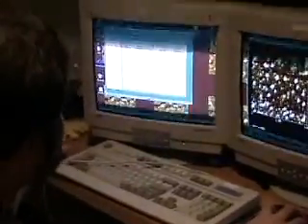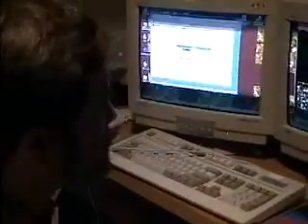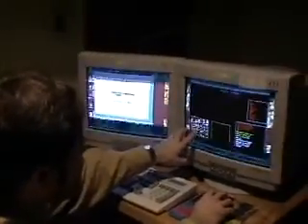The main other thing that you need to know about for the analysis menu is under Analyze, it's Section. This is how you take cross-sections, which is the easiest way to quantitatively measure height differences. I go over to this right-hand screen and draw a line across where I want to take a cross-section. In order to draw a line, it's the same sort of strange mouse system where I click once, release, then move the mouse, so it's not clicking and dragging, and then click a second time to determine the line. And it always automatically extends the line to go all the way to the edges of the image.